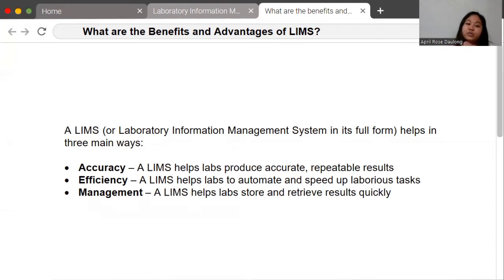So as we have noted, traditional data management practices were prone to errors, diba? Due to the inherent shortcomings of manual entry and copying. So the LIMS automates these processes. So these kinds of mistakes simply don't happen. Okay? They don't compromise the integrity of your lab processes.